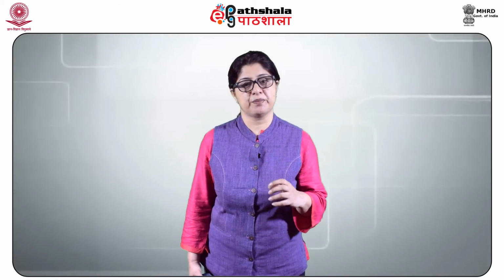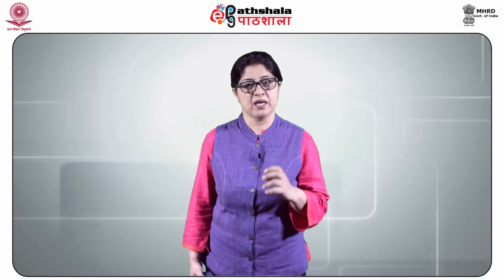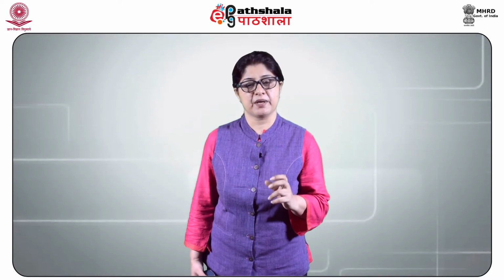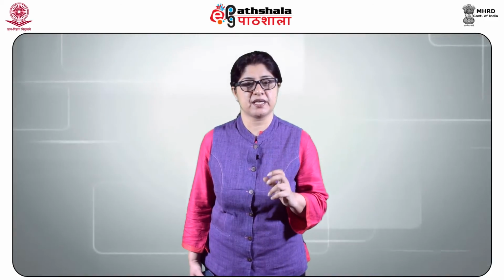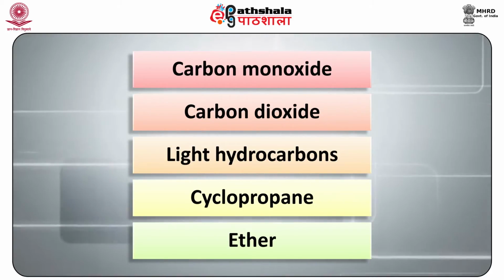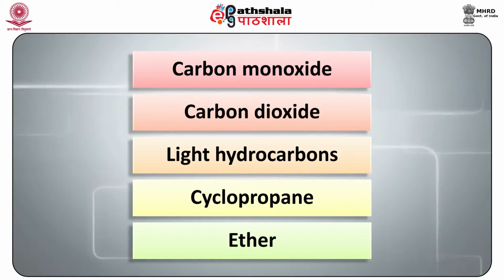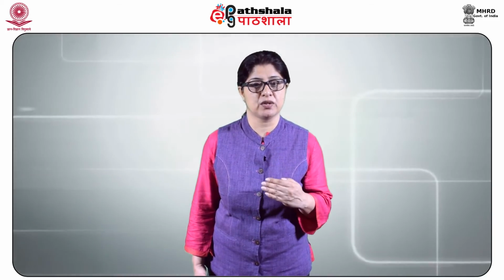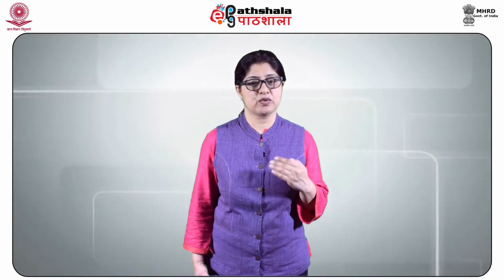Forensic and criminal cases include analysis of ethanol in blood, prohibition cases for the percent of ethanol in alcohol, analysis of drugs, mixtures of one or more components, chemical identification in an individual substance, etc. The gases most commonly encountered by forensic chemists are carbon monoxide, carbon dioxide, light hydrocarbons, cyclopropane and ethers. Carbon monoxide and carbon dioxide are usually absorbed by the blood from the environment of a partial combustion. All these gases are analyzed using GC.